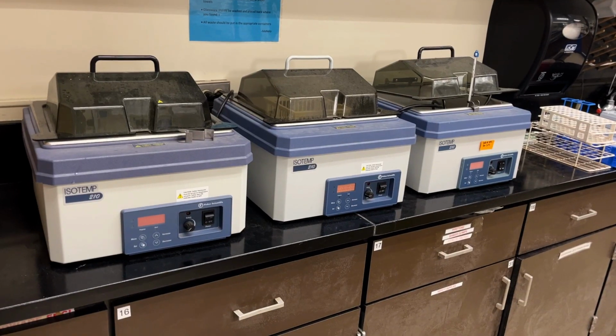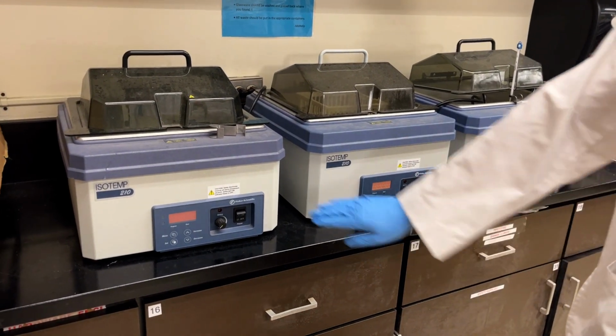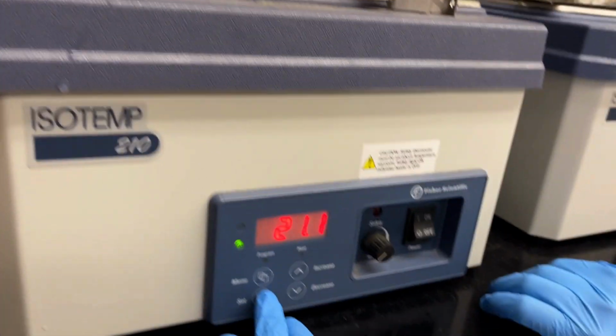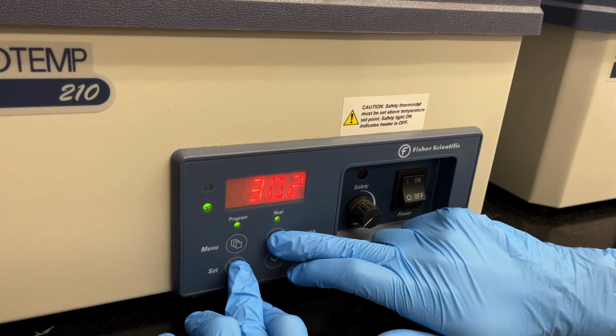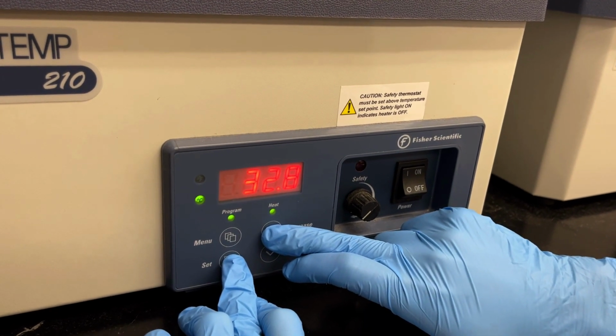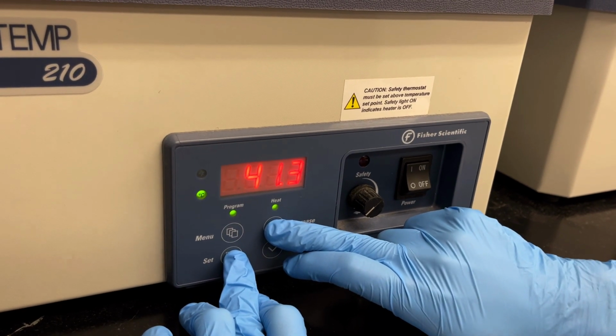Before you get started, there are a couple of things you should get ready because these take time. One is to set your water bath. Simply turn on the water bath, make sure that there's water in it, of course. Hold the set button and hit the increase or decrease button until you reach 42. It will take a little time for the temperature to get there. Make sure that the lid is closed the whole time while you're waiting for the temperature to equilibrate.